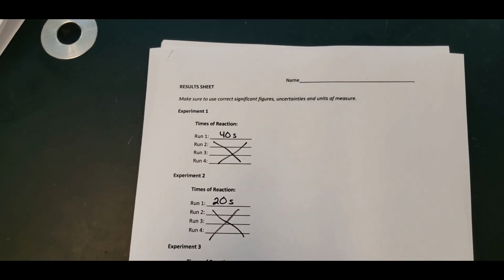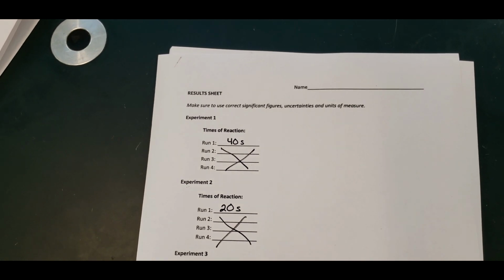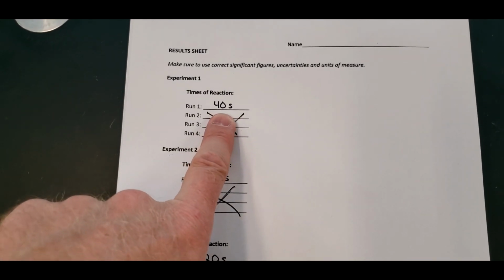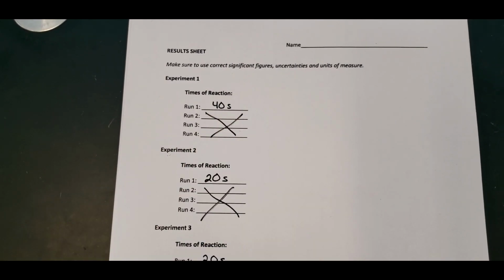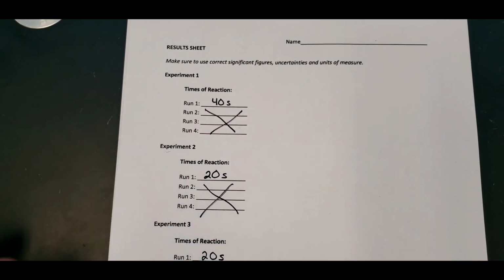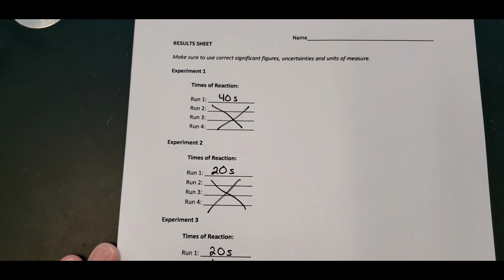Okay, so I'm going to run through some of the calculations for the iodination of acetone. I'm not going to do every calculation, but I will get you a very good start on this. So here is my data. You're going to have a different one. You have 53 seconds for this and different times from these others, but notice we only did one run. But I'm going to use my own numbers. That way you have to do your calculations yourself.